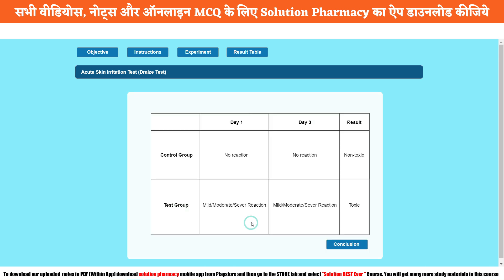Now click on the Result Table. In the control group on day one: no reaction. Control group on day three: no reaction — meaning it was non-toxic, as it did not receive any test sample. In the case of the test group, on day one you may find a mild, moderate, or severe reaction. On day three, the process is the same — the reaction on the skin of the rabbit may be mild, moderate, or severe. It may be mild on the first day but could convert into moderate or severe by day three.